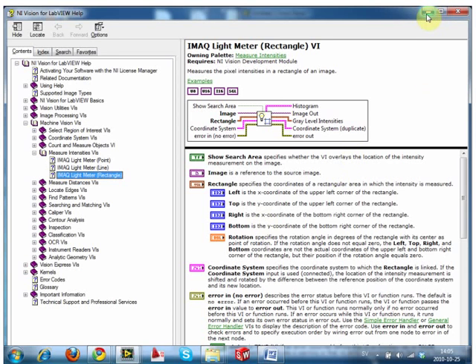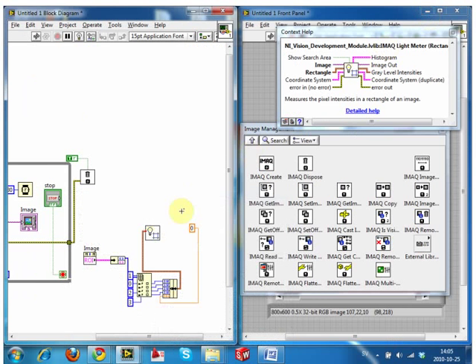I have a question. So it means that we don't want to rotate. Right. So we just cannot skip it somehow? No, because it's expecting 5. So it's a bundle. Okay. It's a bundle, and it's saying, look, I expect 5 bits of information. And when it opens it up, there's only 4 bits of information, so it's like I'm missing. But why does it expect 5? Because the people that wrote this VI expect 5.